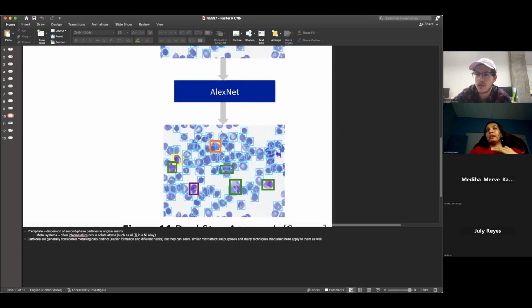Yeah, because normally the backbone of faster RCNN is already inspired by AlexNet, VGG, or GoogleNet, or different things. So just applying it two times seems to me a little bit not well understood, because YOLO or faster RCNN are quite robust in doing analysis for the most part.